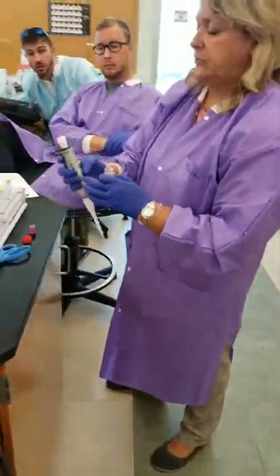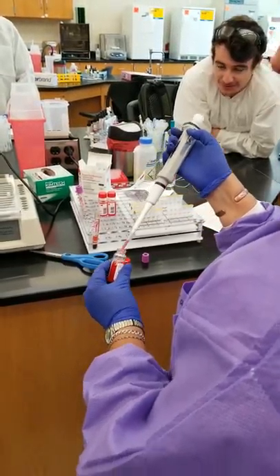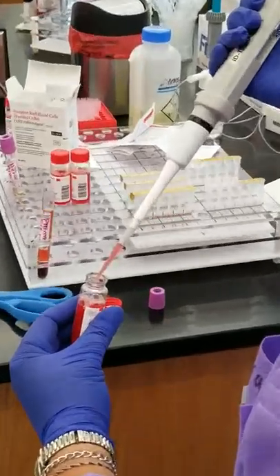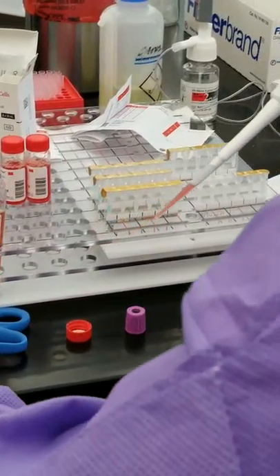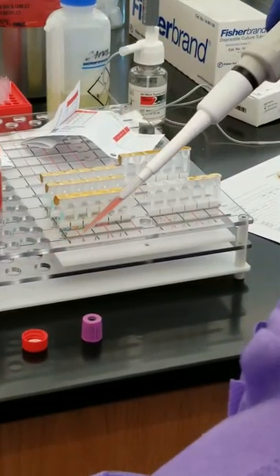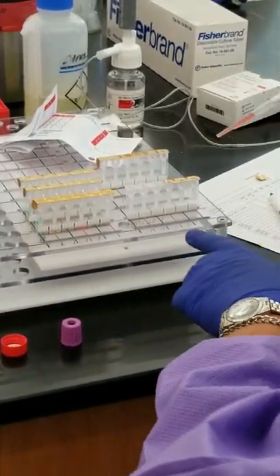So it has this little silver thing on the side. You're going to draw up, not a ton, but all the way to this little shoulder area. Dispense the first little bit back in. It has a pretty large dead space, so you can't really drain it dry like you can some pipettes. And I'll show you that in a minute.